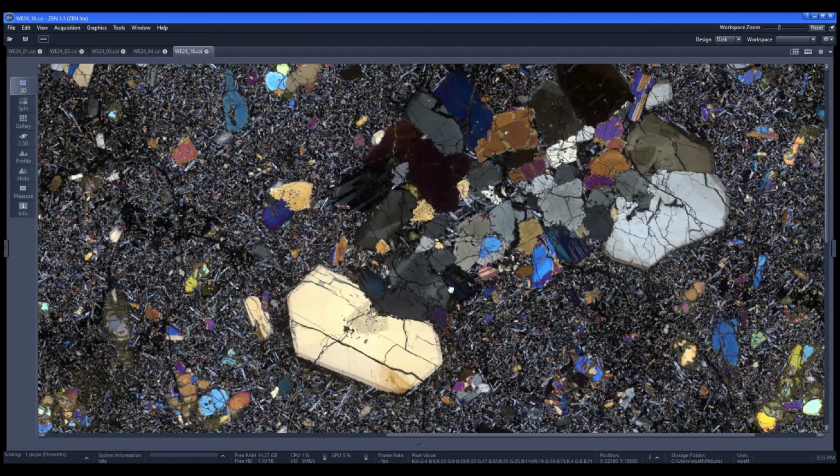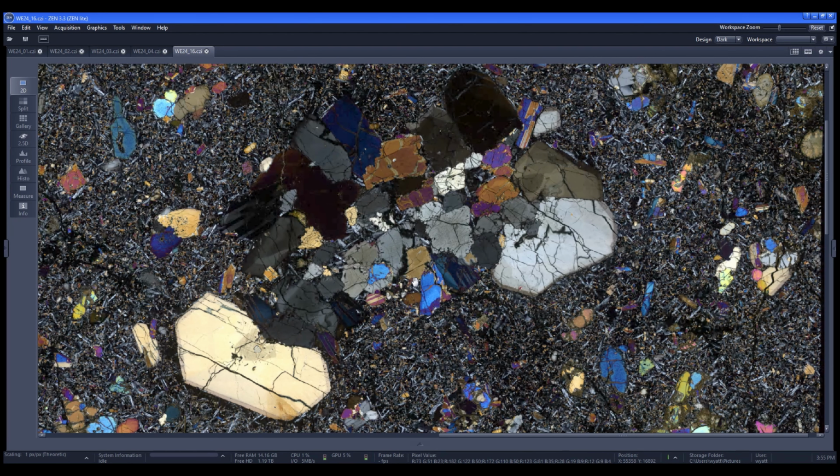How cool is that? So I think I'll wrap it up here. I've been talking for quite a while, and I showed you all kinds of different things and explained all kinds of different scientific terms, and hopefully you didn't get lost in my science jargon. But anyways, I hope you found this informative, and I hope you enjoyed seeing all these minerals in thin section. It's not something you see every day, and I think it's really cool, and there's a lot you can learn about rocks by studying the minerals in thin section.